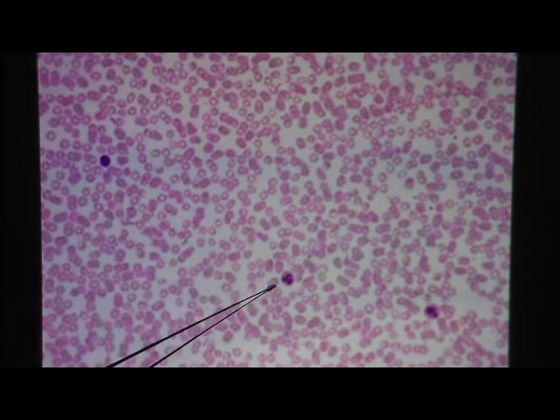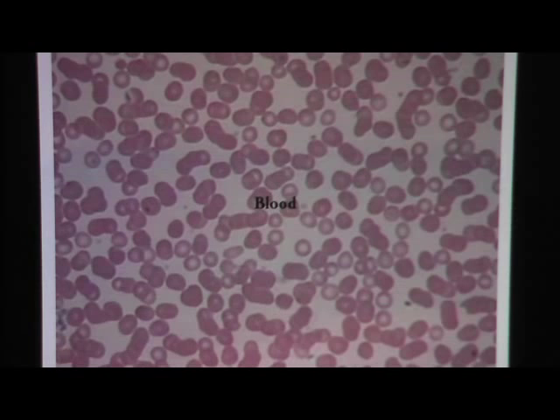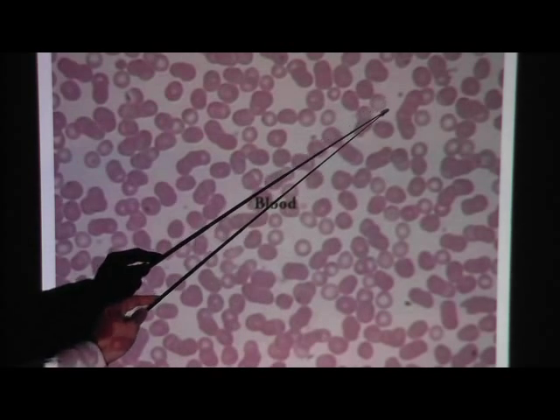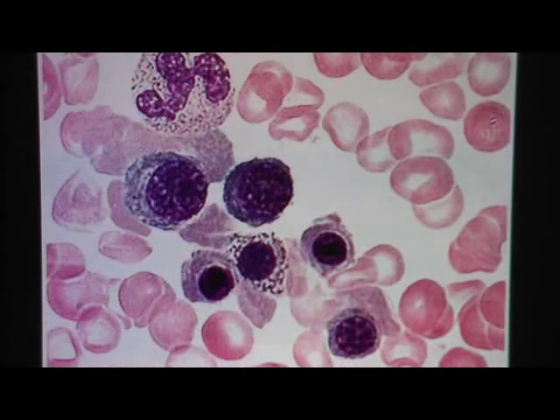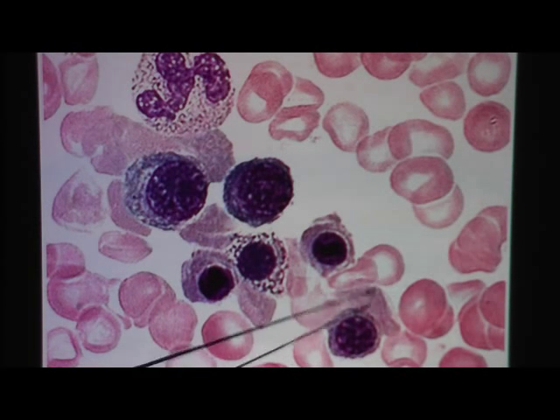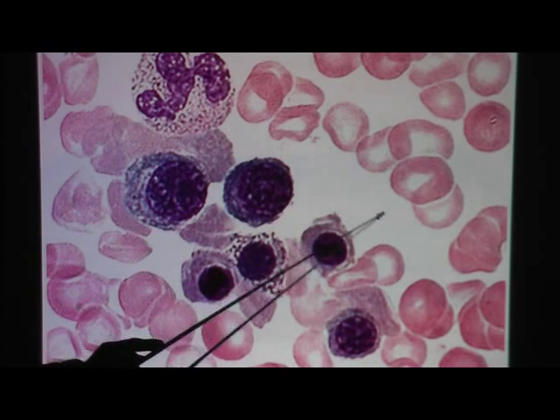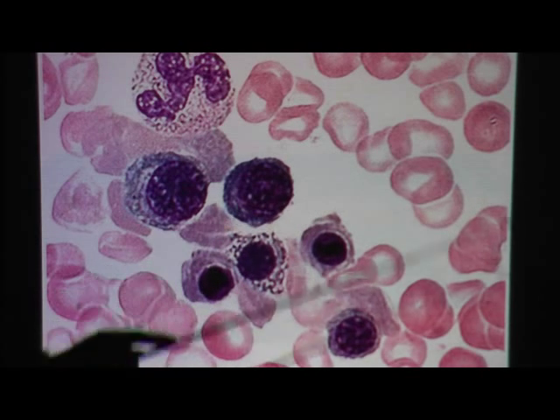This is really low power — you see a lot of red blood cells and three white blood cells. The white space in between is plasma. This is magnified 400 times and all you see in this slide is red blood cells, maybe a couple of platelets. Here you see white blood cells and these are red blood cells. This is very high power, and the rest in between would be plasma.